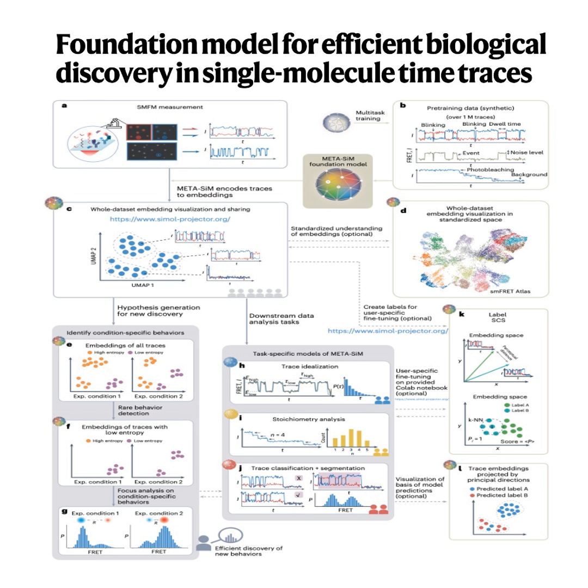How quickly? They apparently did this within about a week, which is incredibly fast for discovering a new intermediate in such a complex system. What was this intermediate state? It was represented by a rare minority population of traces showing low FRET values. It corresponded to a more extended conformation of the pre-mRNA, and it seemed to be involved in selecting the correct spot for the final splicing cut, the 3-prime splice site.